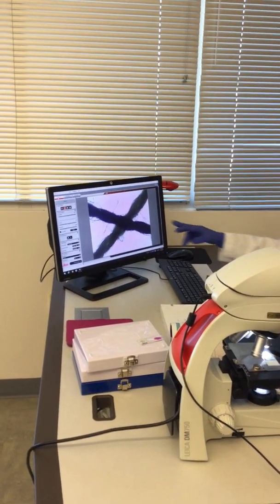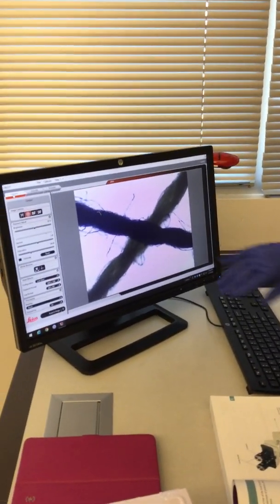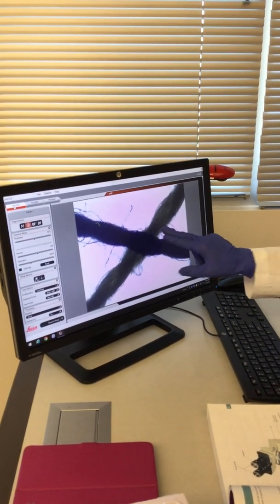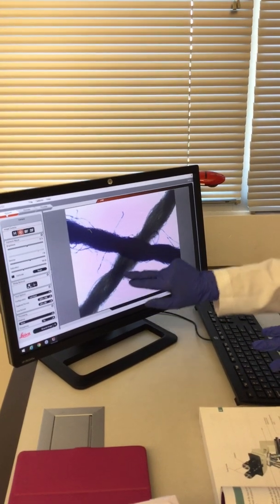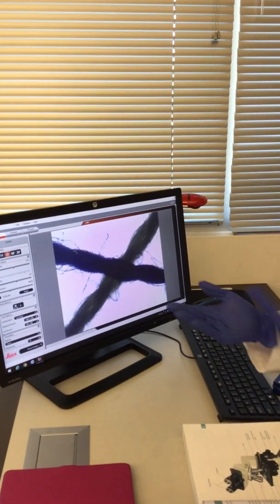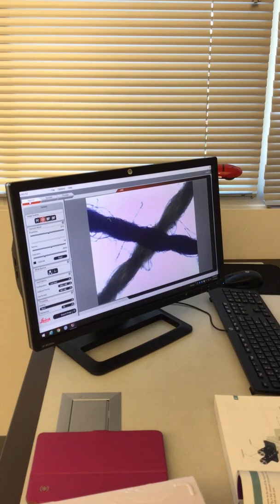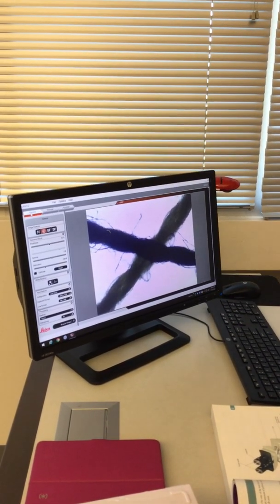In this case, let's say I'm looking at the yellow one because they're almost kind of flat to one another, so that's why it's very hard to find the depth. But in this case, you see much better the actual dual threads that make this yellow thread. It's like a DNA spiral, two strands. So these are two strands of the yellow one, so you can see it better than the ones in here.